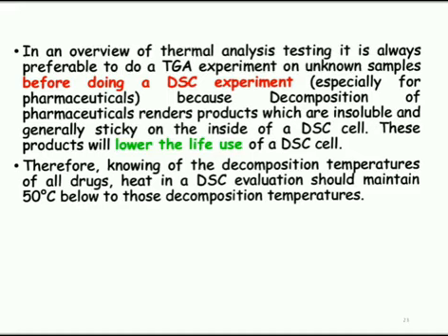These products will lower the life of a differential scanning calorimetry cell. Therefore, knowing the decomposition temperature of the drugs, heating in a DSC evaluation should be maintained 50 degrees Celsius below that decomposition temperature.